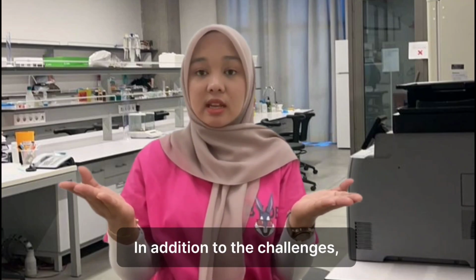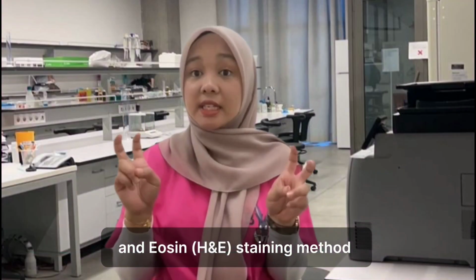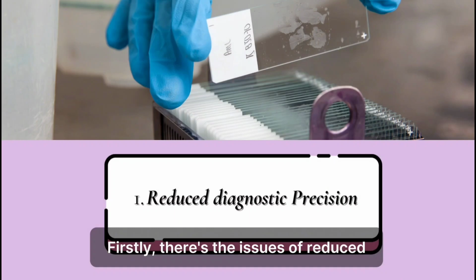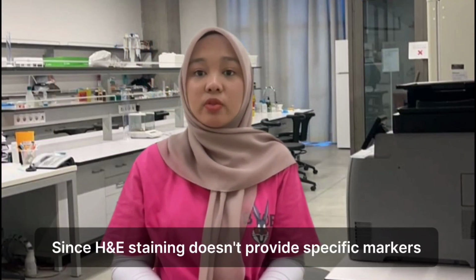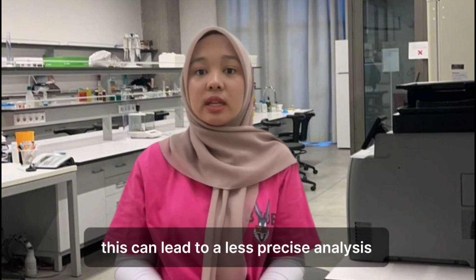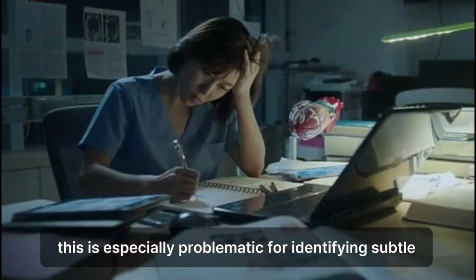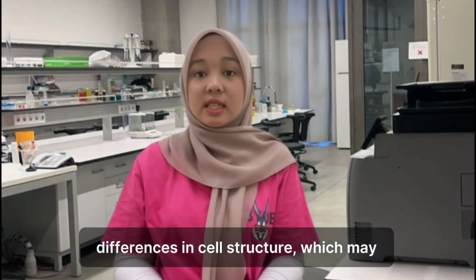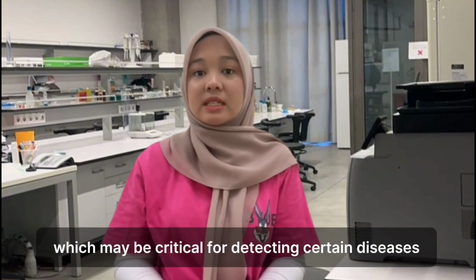In addition to the challenges, there are also some notable effects of using the traditional hematoxylin and eosin H&E staining method. Firstly, there's the issue of reduced diagnostic precision. Since H&E staining does not provide specific markers for individual cellular components, it can lead to a less precise diagnosis. This is especially problematic for identifying subtle differences in cell structure, which may be critical for detecting certain diseases early on.